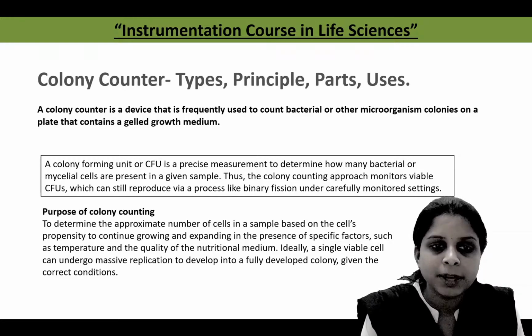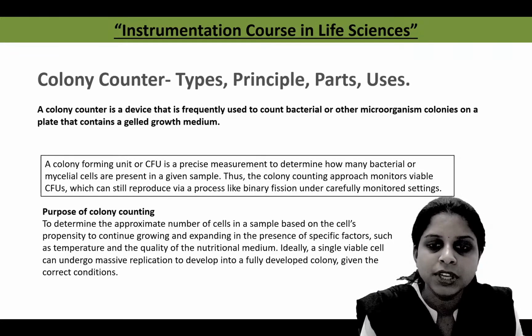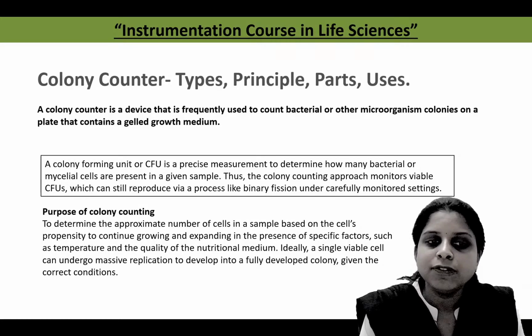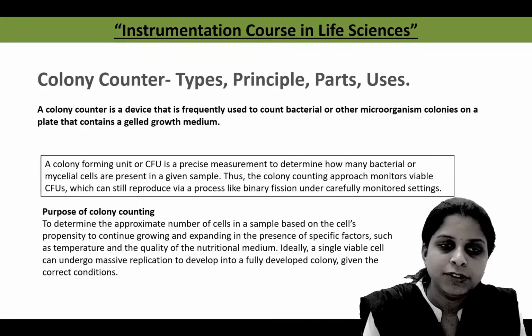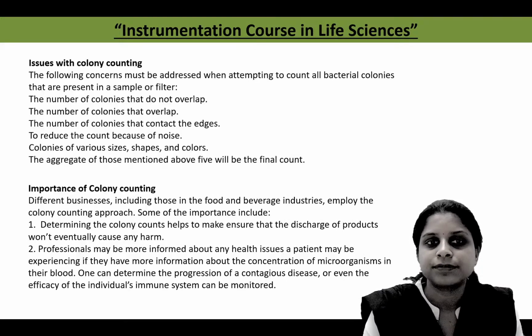Ideally, a single viable cell can undergo massive replication to develop into fully developed colonies in the form of CFU, and these fully developed colonies are measured as colony forming units with the help of the colony counter.